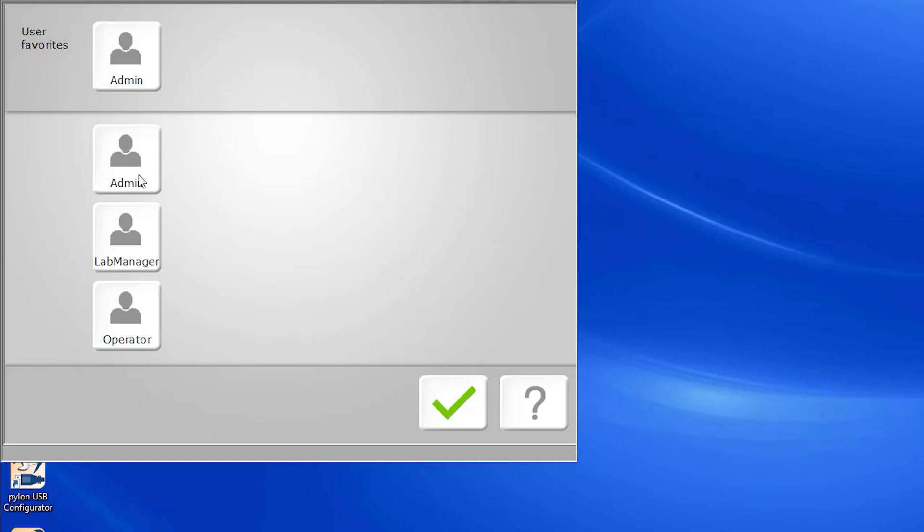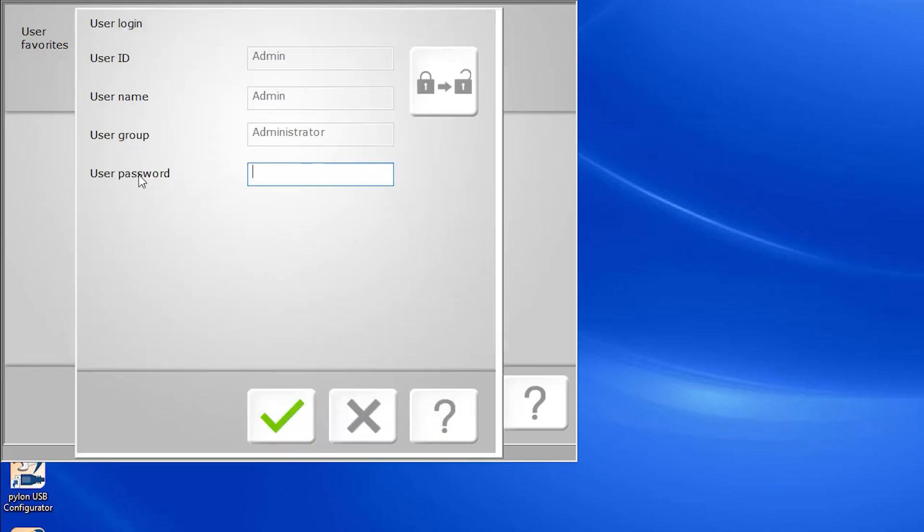For today's purposes, we'll be utilizing the GUI via administrator access so you can see all the available functions.